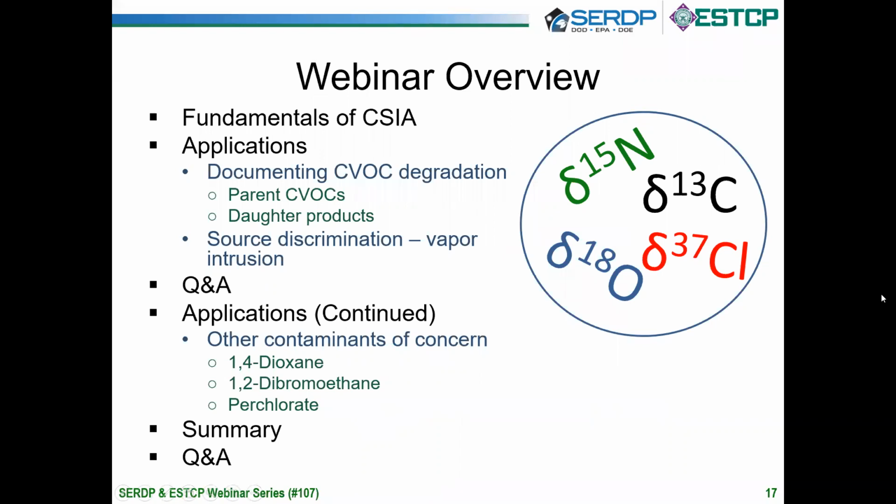So just as a quick overview, I'm going to start and talk a little bit about fundamentals and then move into applications, particularly for chlorinated solvents, looking both at documenting degradation, daughter product degradation, as well as a little bit about source discrimination with vapor intrusion. We'll have a pause for some Q&A, and then I'll move into some emerging contaminants or other contaminants of concern, including 1,4-dioxane, dibromoethane, and perchlorate. And then a quick summary, and we'll wrap it up.